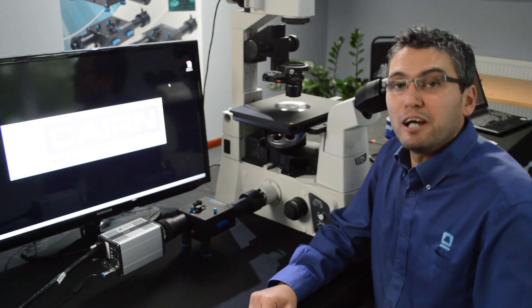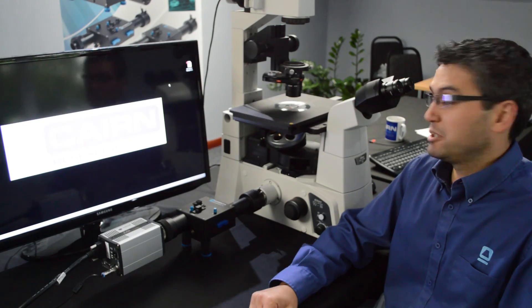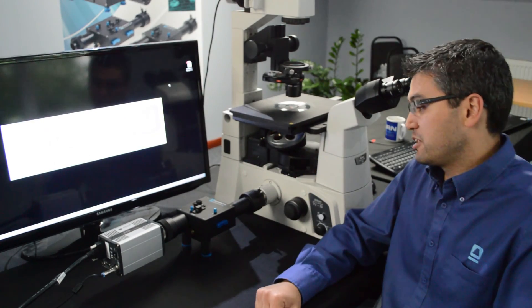Hi, my name is Joao and I'm a Support Specialist for Cairne Research and today I'm going to be talking to you about the OptiSplit 2.